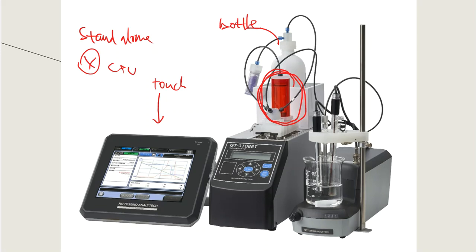They will often keep these two things together, so that you know what is supposed to go into that jug. Same kind of deal though. You still have to go through the process of standardization. You have to make sure that you calculate the correct concentration of the titrant that you are using through your lab experiment and key that value into the computer system, because very often it does not do that automatically. You have to do that as a user. So the same thing would happen with an automated titrator, just like a hand titrator.